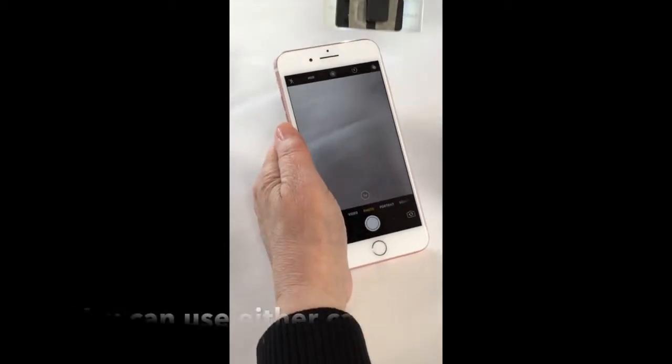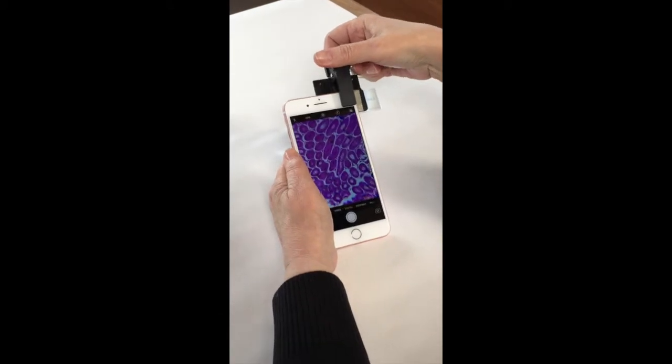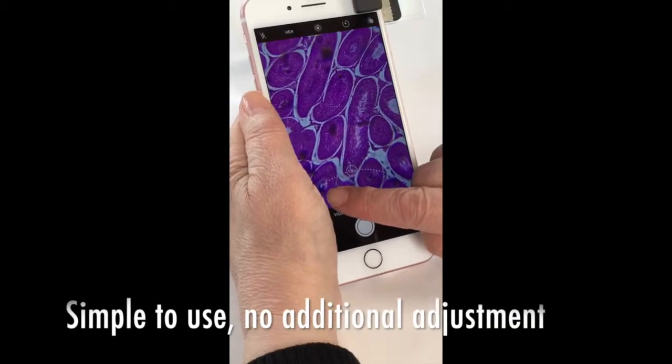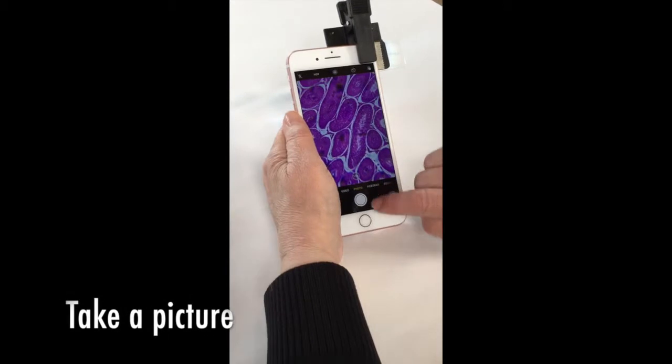You can use either camera. Using your built-in camera zoom, you can zoom in and get higher resolution. There's no additional adjustment, simply using your camera app. Take the picture and it's saved.